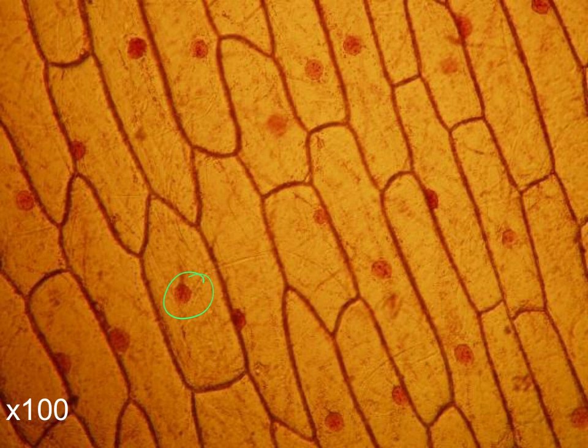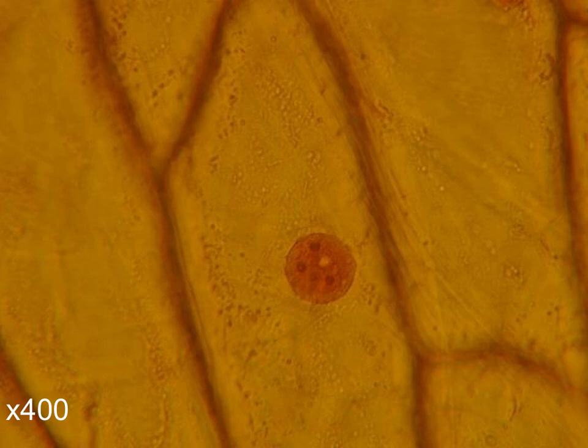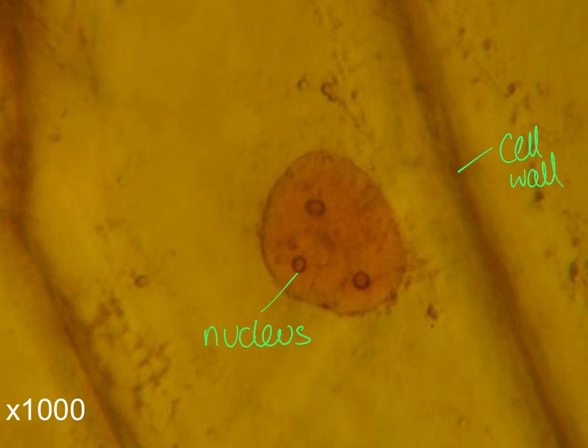We're going to go one closer. There it is times by 400. And actually we've even got one closer again, and you can see that structure there of your cell wall and your nucleus. And that cell will be filled with that solution of cytoplasm, and along the inside of the cell wall you have what you call your cell membrane, which controls what goes in and out of the cell. And so this solution here is your cytoplasm.